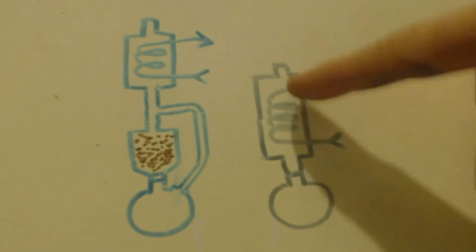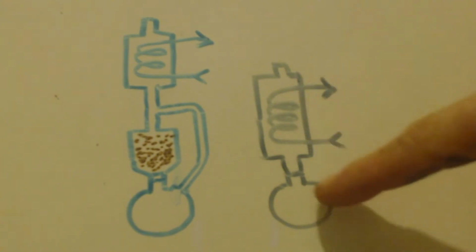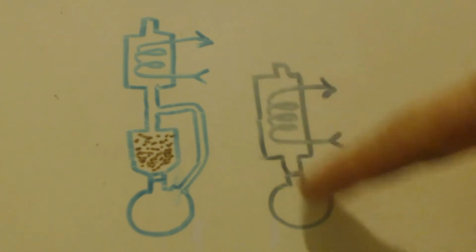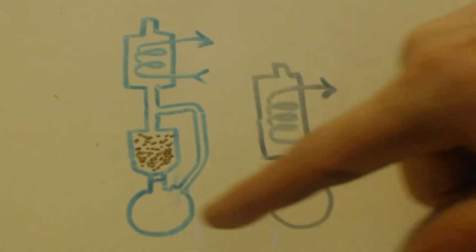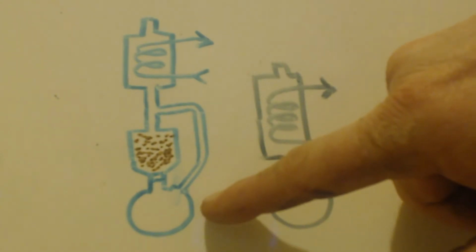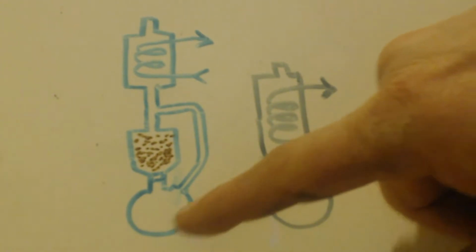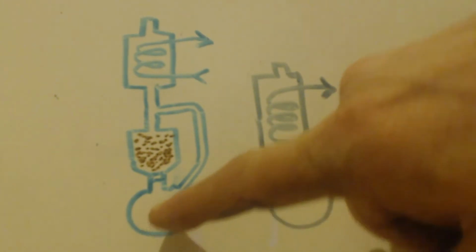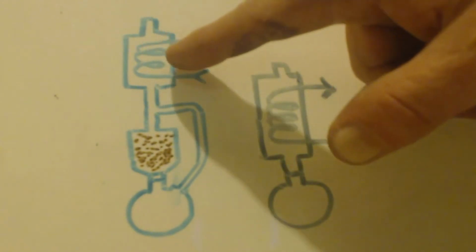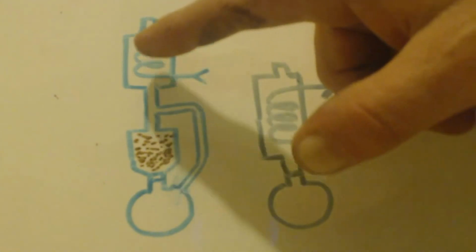I want you to look. This is a regular refluxing. You know, you got your round bottom flask and you have a water cooled condenser. You boil your stuff and you can't escape because it's so cold up here. It condenses back down into the pot. This is basically the way a Soxhlet reflux apparatus is. Your pot boils, it goes up this little tube, and then it goes up into a condenser. All right. When it condenses down, it can't escape because it's too cold.